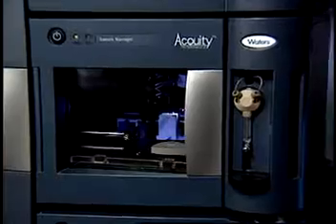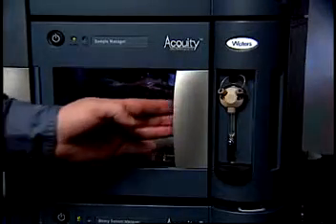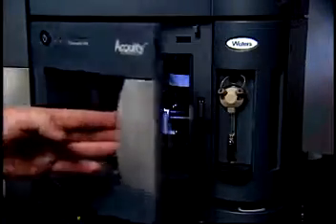Before performing any chromatography, you must verify that the XYZ mechanism positions the needle properly in the sample chamber. To begin, open the sample manager door.